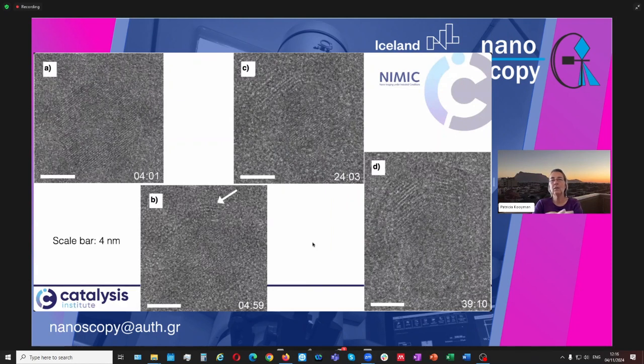What we actually saw was that as soon as a particle was completely encapsulated in carbon, it would stop growing new layers. So what we think is that the carbon monoxide needs some empty surface to anchor, and then it gets reacted to atomic carbon and carbon dioxide via the Boudouard reaction. And then the atomic carbon diffuses through the cobalt nanoparticle to form layers at the other end. And the carbon dioxide, of course, is just removed with the gas phase.